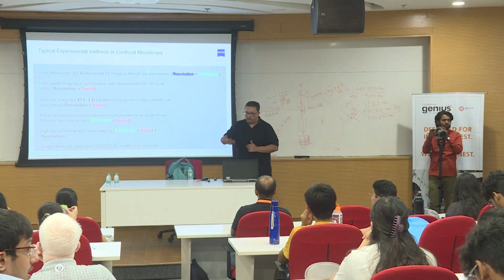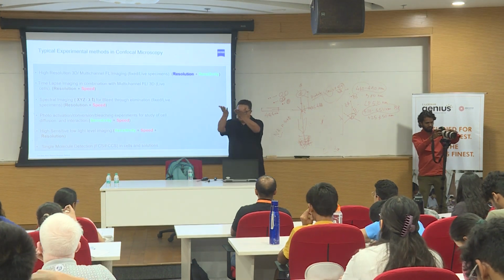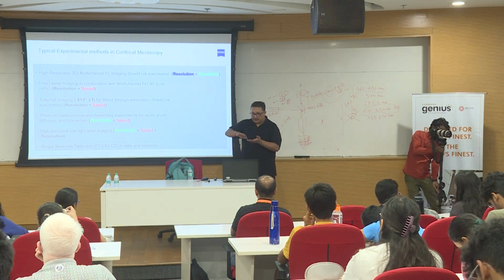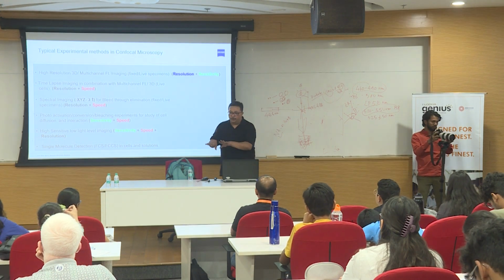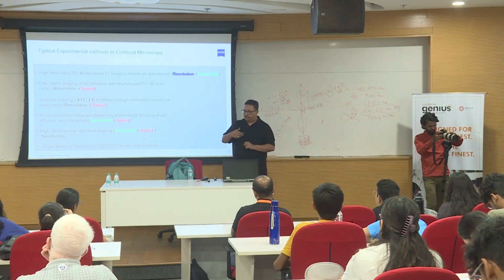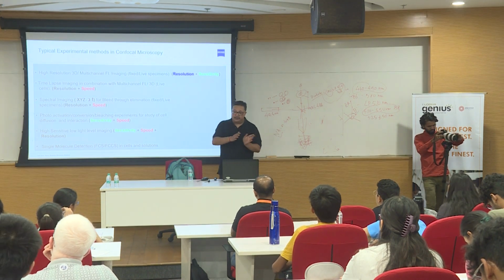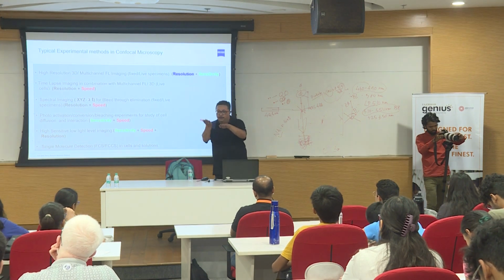The more the exposure time, the better signal you generate, but the background also gets lifted up. Noise is nothing but signal coming from the background, where there is no sample. If you increase the exposure time or the detector gain by applying a voltage, the higher the voltage, the higher the signal, but it also increases the noise.